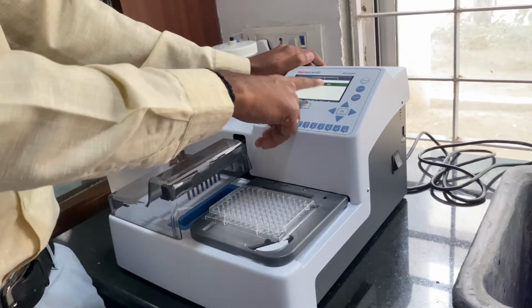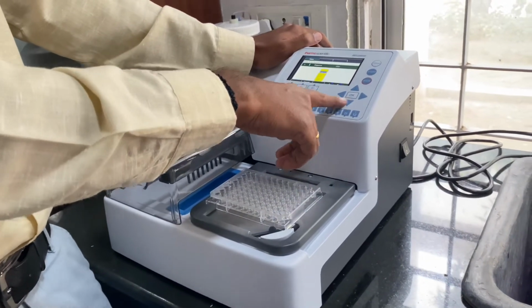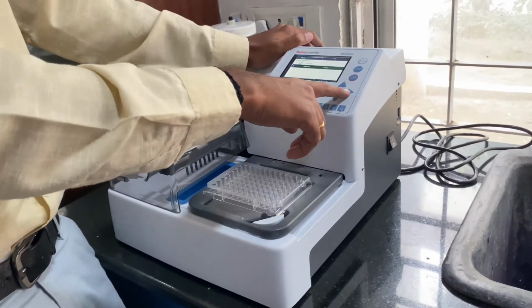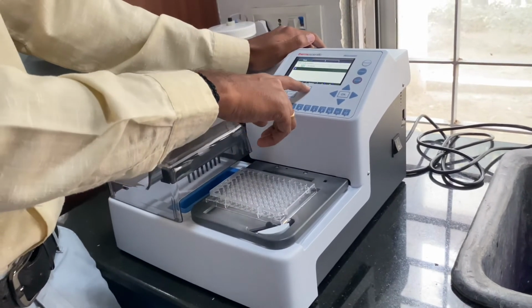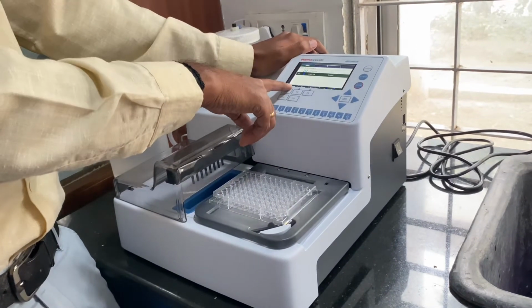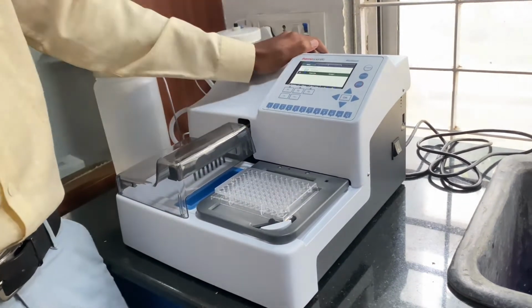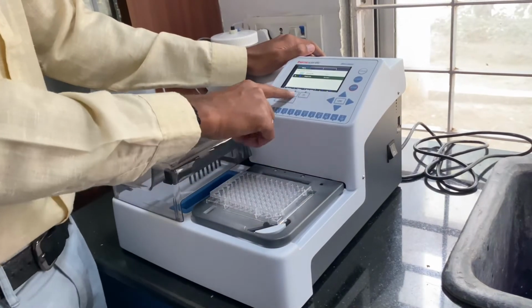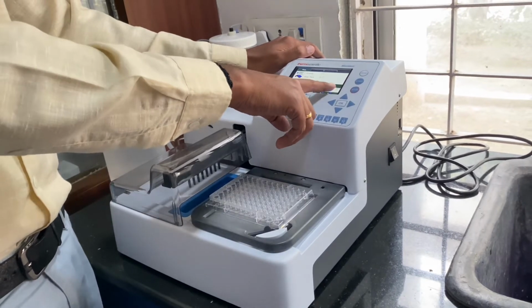First, dispense 300 microliters. Next, new step. Then we will just say aspirate. This is the aspiration step. So like this we can insert multiple steps we can define. Multiple aspiration, dispense, multiple aspiration. So whatever procedure you are having, you have to make this protocol in this way. Then I will say close. So now we have one dispense and one aspirate step.